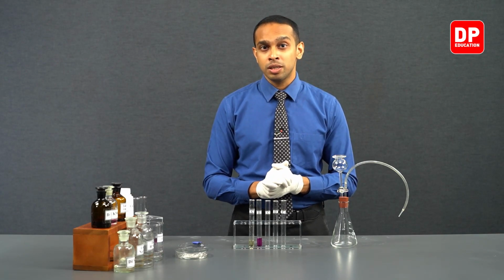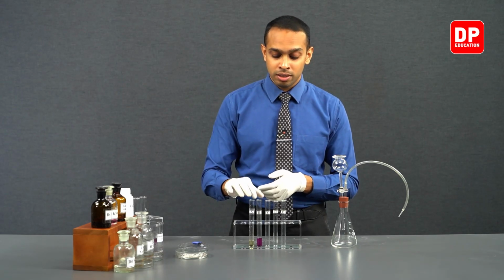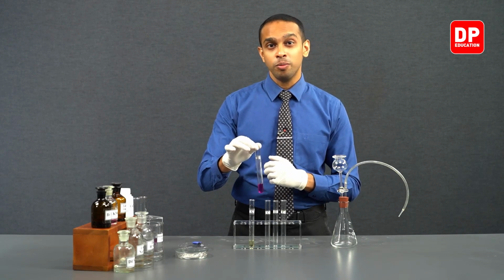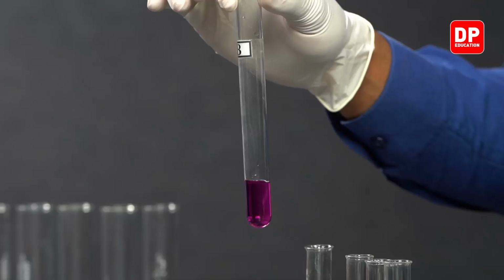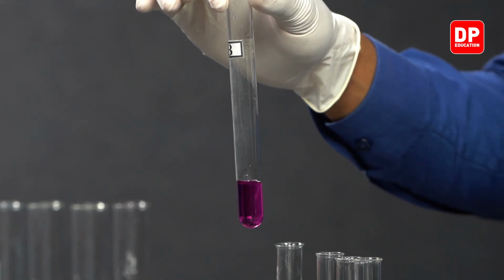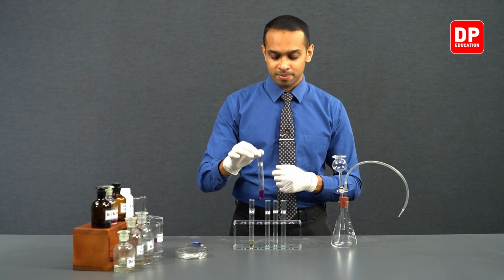However, you have to make sure that you understand that when you observe a brown color in the test tube, it is not due to the formation of a solution. What you are going to be forming is a brown color suspension. So this is the positive result of the Baeyer's test. If you don't have an unsaturated hydrocarbon reacting with this alkaline potassium permanganate, there will be no color change.